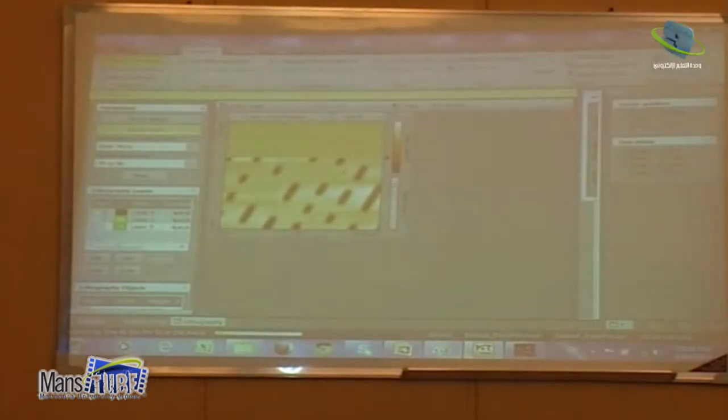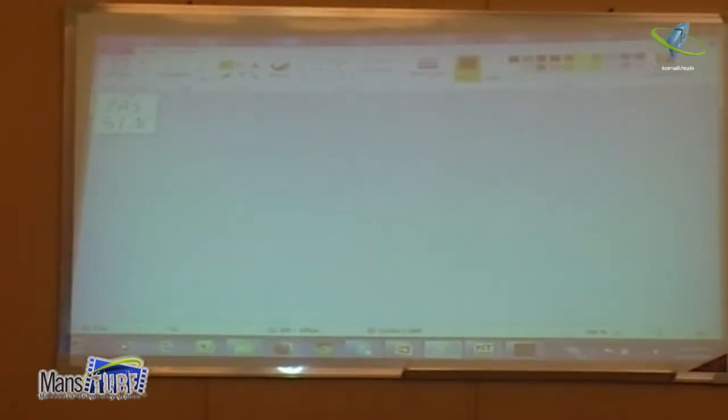Let's say what you do. You may open Paint. Okay. And then you make an image, let's say maximum 100 pixels times 100 pixels. It must be around this range. Let's say if you write, let's say, Yasin or something. Okay. You make it in black and white.